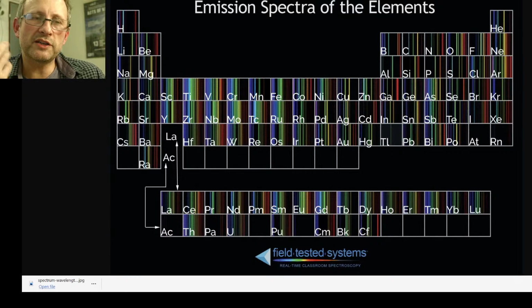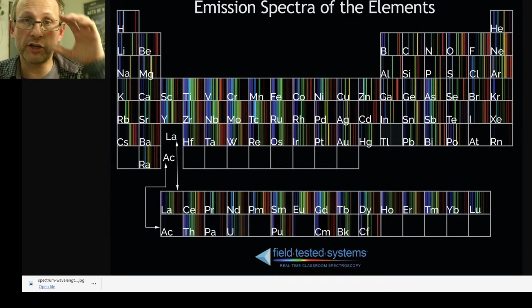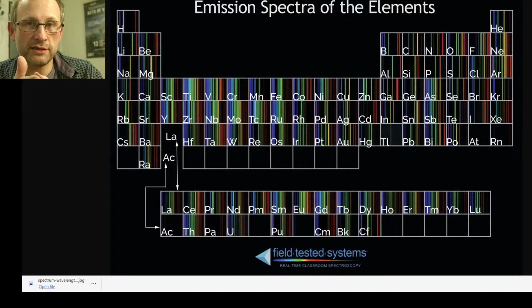And the question is, do we see other elements like titanium and vanadium? Do we see things like copper? And an increase in things like iron and so forth. Now, you could argue that, for instance, carbon could become carbon dioxide and then come out of the reactor, so you have a relative increase in iron that might be in there anyway, or that as the reactor gets more energetic, then you see iron being produced, or rather iron being excited or being lofted.